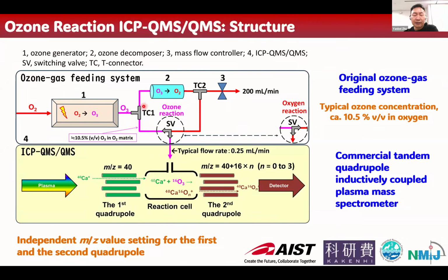The residue of this ozone is decomposed back to oxygen and exhausted as a green discharge.